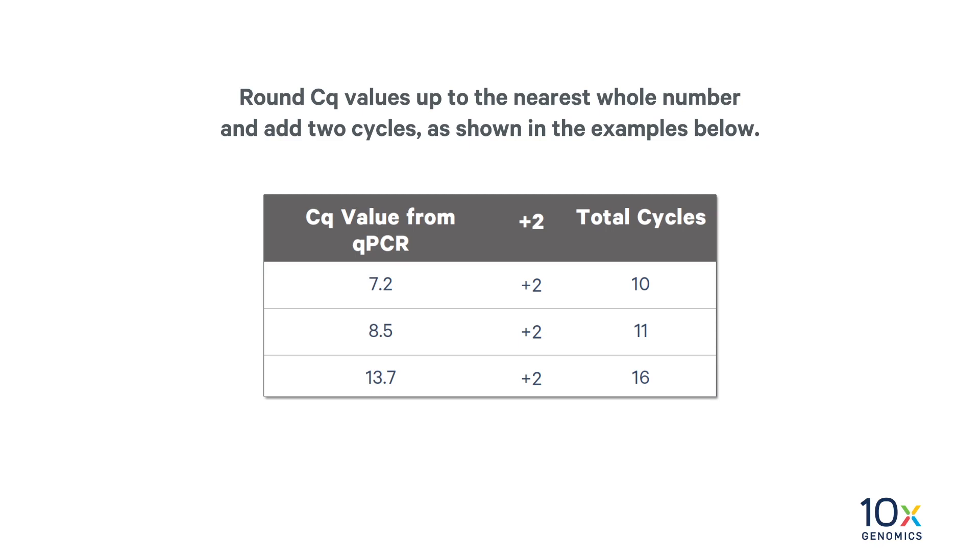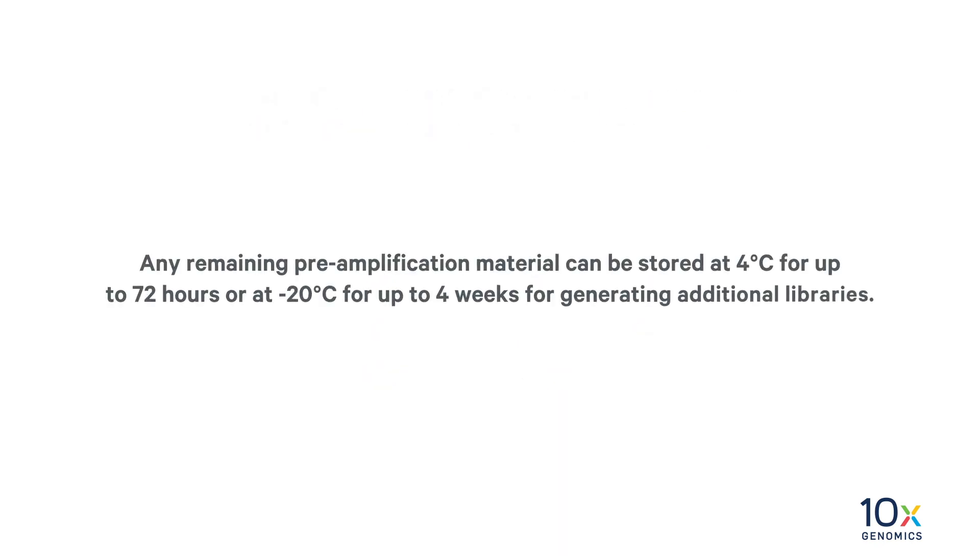Any remaining pre-amplification material can be stored at 4°C for up to 72 hours or at -20°C for up to 4 weeks for generating additional libraries. Next, we will perform the SPRI select cleanup.